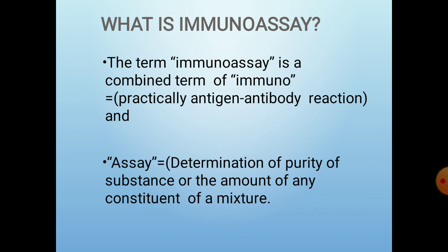What is immunoassay? A major question comes here. The term immunoassay is a combination of two words, immuno and assay. Immuno means practically the antigen antibody reaction, and assay means determination of the purity of a substance or the amount of any constituent of a mixture.